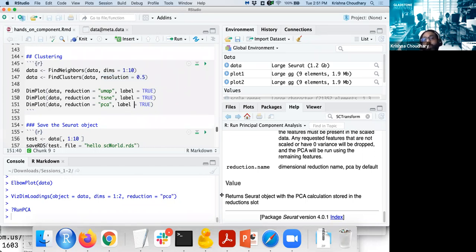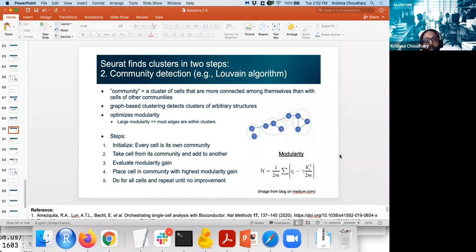That is the kind of approach in the field now. But there are also some statistical tests based on comparing differences between clusters. Like when the differences between clusters plateau out, that's the level of resolution you set. And there are other ways that people do it, but we don't have time to discuss all that.